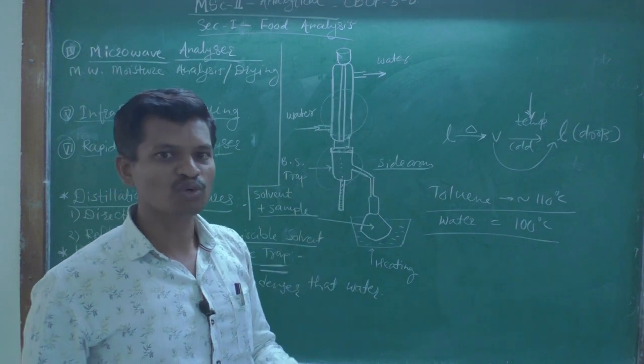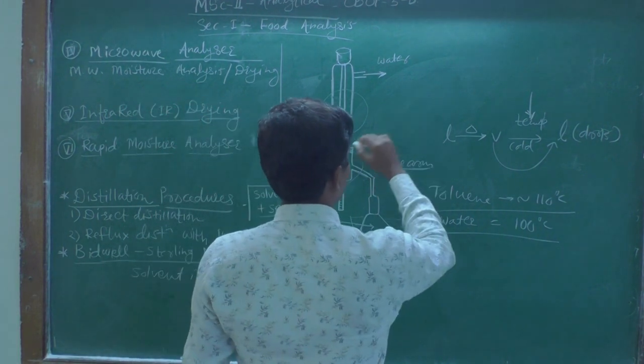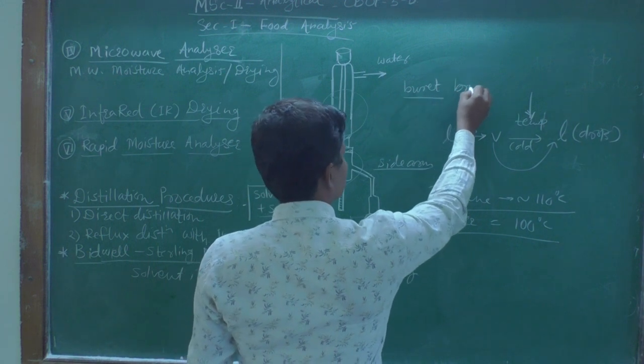So what we are going to do here is use a burette supported with a brush.